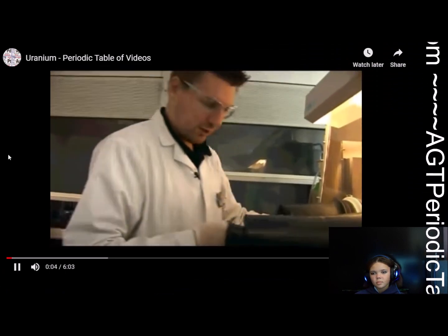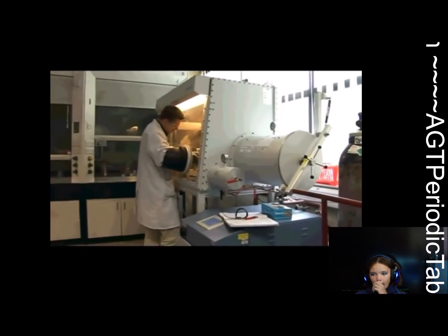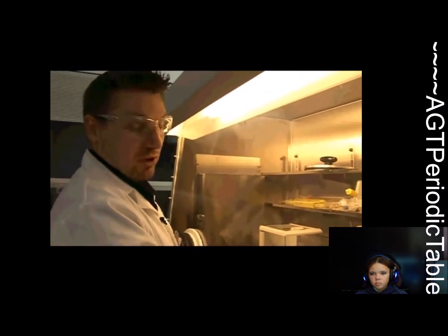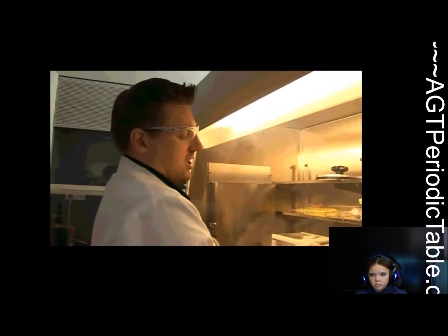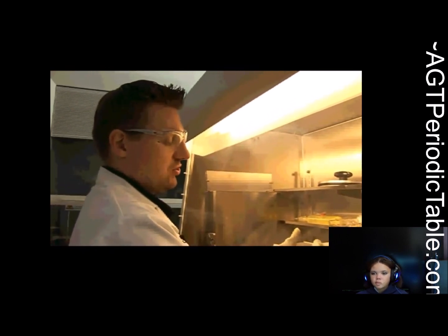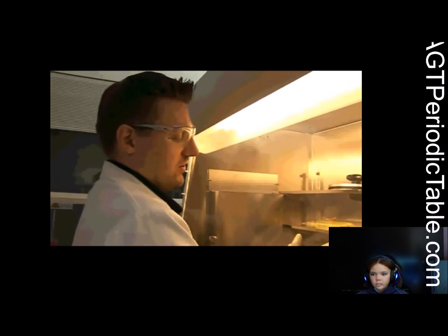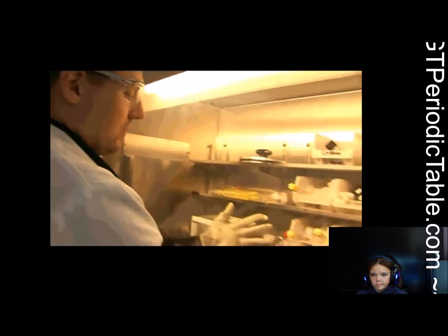So this is one of our glove boxes. If you just look to the right of the glove box, you'll see that we've got these airlocks, and basically what you do is you put whatever it is you want to take into the box in there, and then you evacuate it, and then you refill it with dry oxygen-free nitrogen. So then you can take compounds which react with air and moisture into the box safely and store them. This is a bit like what you see pictures of in the nuclear industry when you've got people handling things.